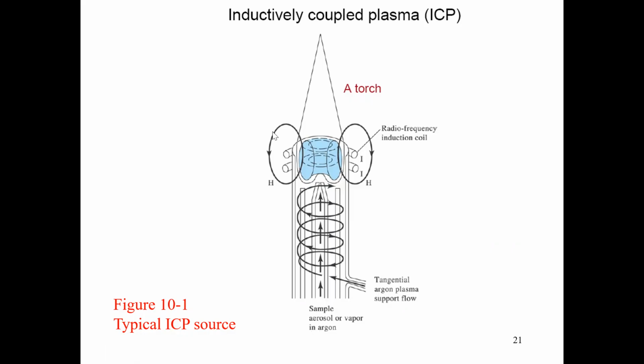And then typically after that, there are three concentric quartz tubes, and usually they withstand these very high temperatures before you go to the torch. The torch is really what you see as those conducting electrons and argon.